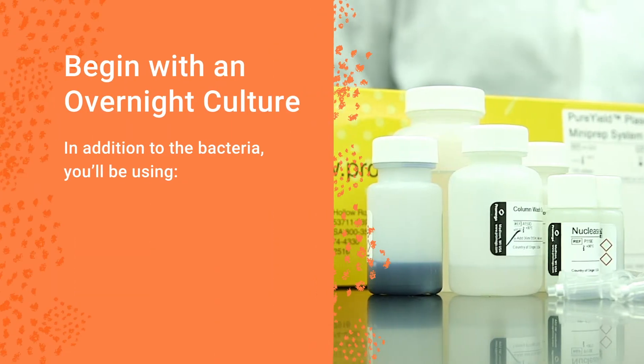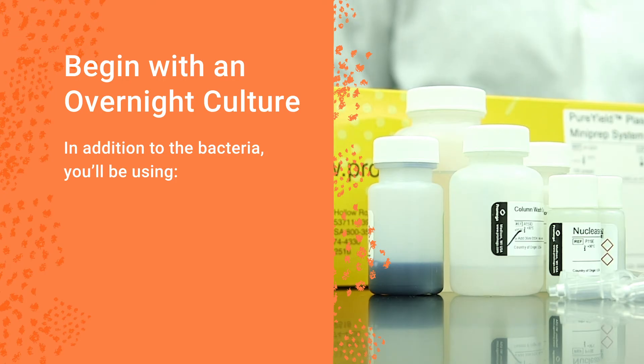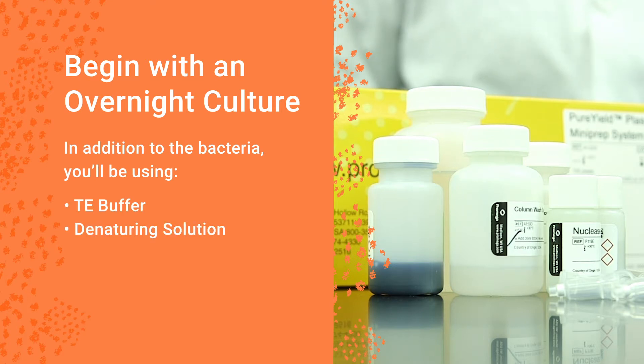Whether using a kit or other method, plasmid purification protocols start from an overnight culture of bacteria and use reagents such as TE buffer, a denaturing solution, a renaturing solution, and ethanol.